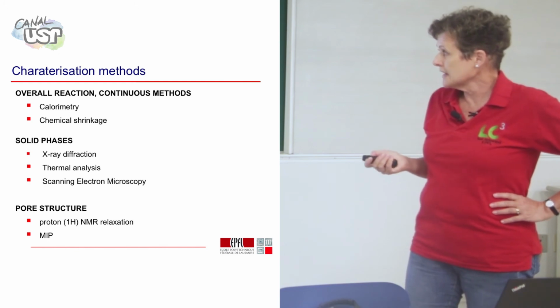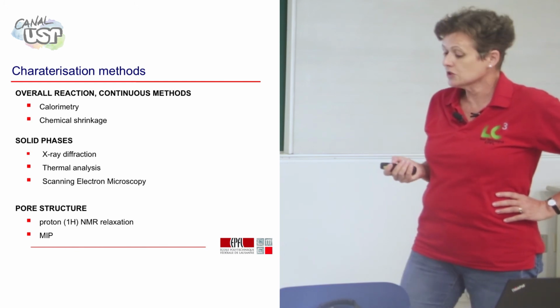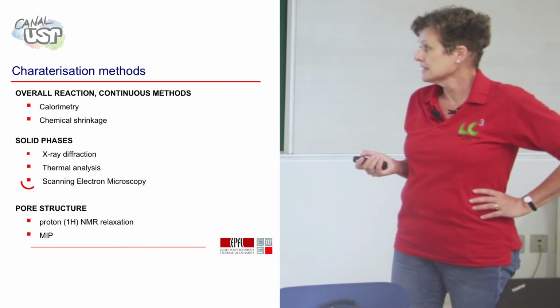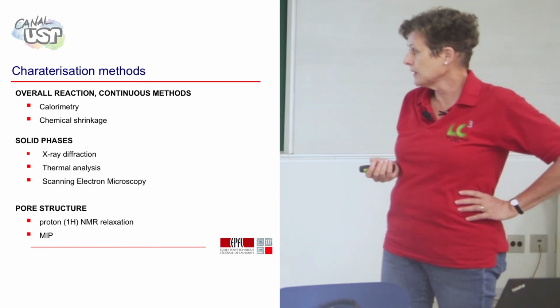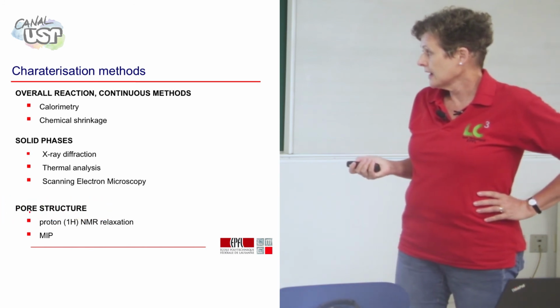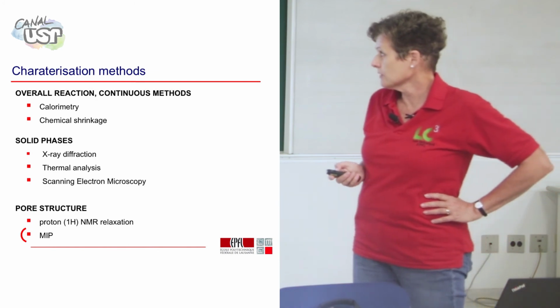Then for the solid phases, the main methods which we're going to talk about today are X-ray diffraction, thermal analysis, and scanning electron microscopy. And for looking at the pore structure, we have proton NMR relaxation and mercury intrusion porosimetry. So before we go into more detail, I just want to underline some basics which are very important.